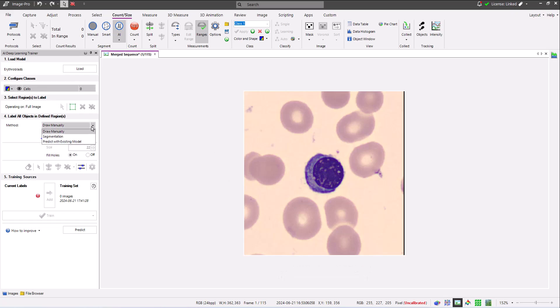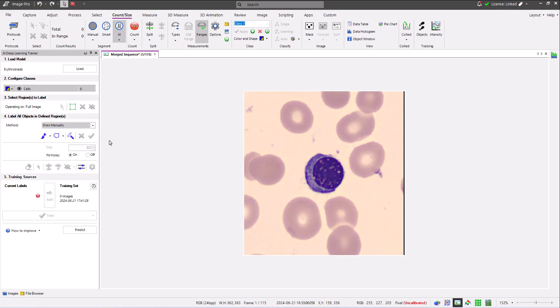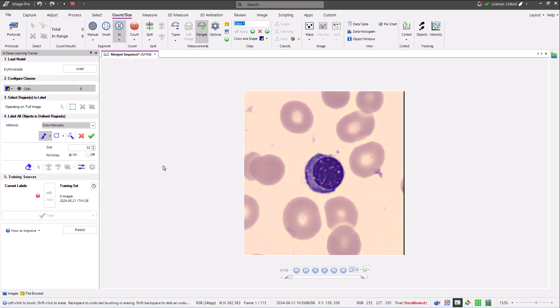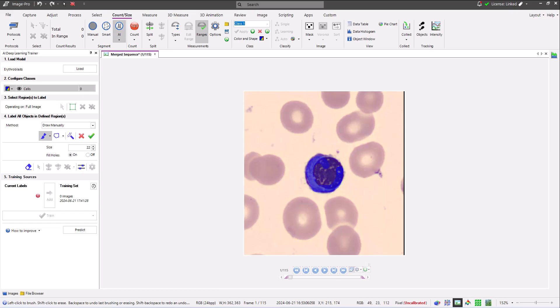There are three methods you can use to add training objects: draw manually, segmentation, and predict with existing. I'll start with draw manually. You can select any of the labeling tools available in the training panel, of which my favorite is the brush tool, and draw the shape that corresponds to the object of interest. With fill hole selected, I just need to draw the outline before clicking the validate button or clicking the return key.